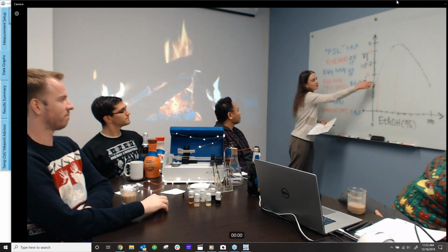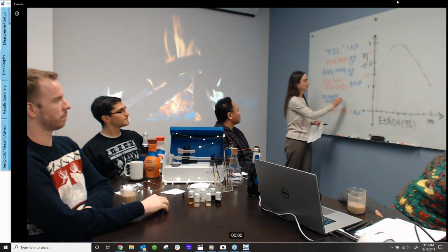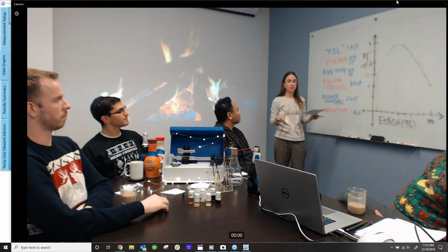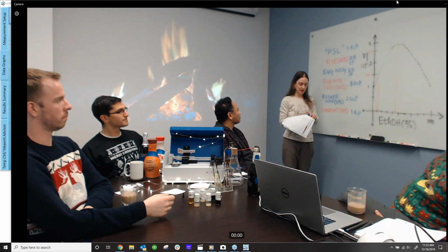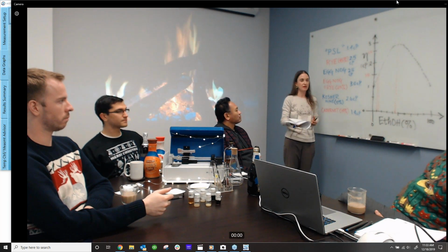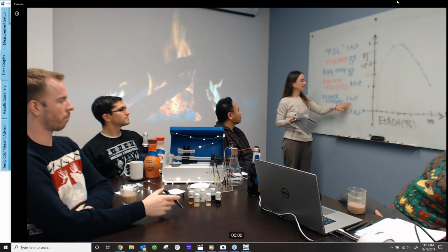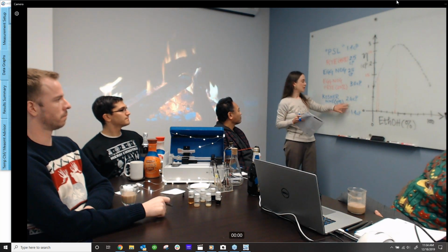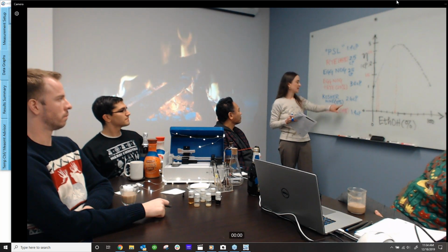The kosher wine, however, is only 11% alcohol, so less there. If you're thinking about just alcohol content, you'd think the viscosity there would drop. But this one is actually significantly higher, about 2.6 centipoise. However, when Brandon was measuring this, he did mention that it's highly sweetened. And so that's another thing to consider. When you add a lot of sugars or corn syrup in high levels, this will increase the viscosity significantly. So likely, although it has lower alcohol content, it has a lot more sugar than Cabernet, giving you a much higher viscosity.